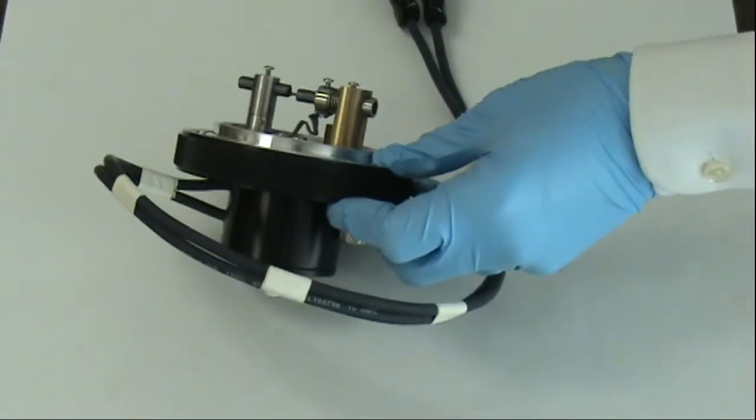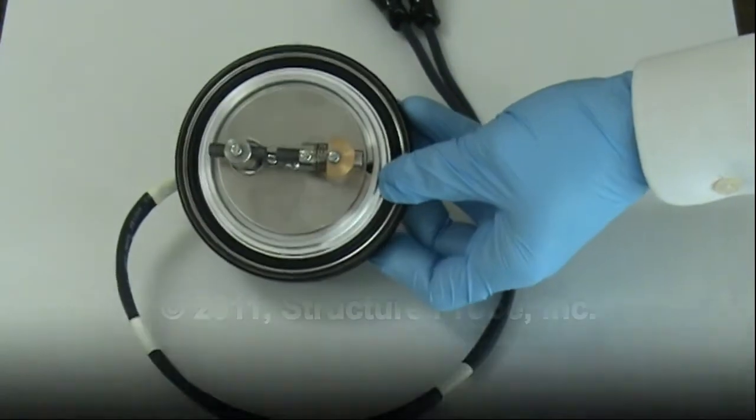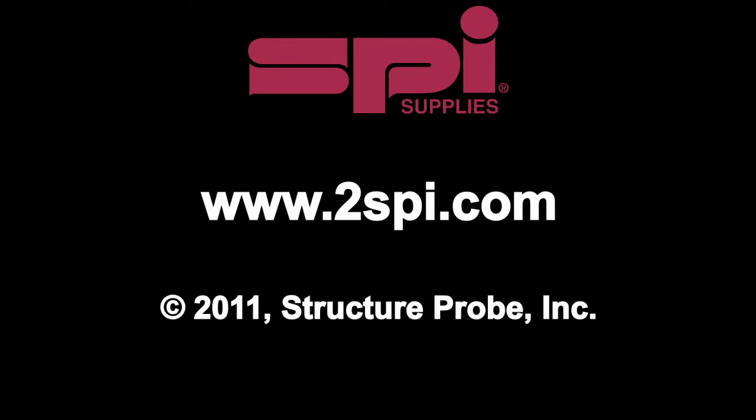This concludes the carbon rod video. Be sure to see our other videos on our website, www.2spi.com.